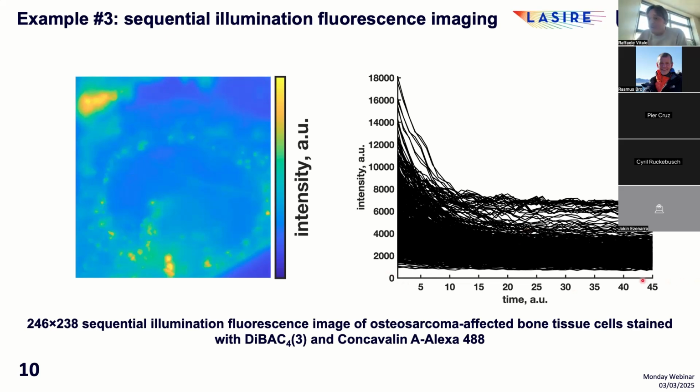Recovered over 45 consecutive time instants across a series of 6 photo-bleaching recovery cycles. During these cycles, the laser power was modulated differently in an attempt to emphasize the distinctive dynamic behavior of the various fluorescent species bound to the individual compartments of the system under study. Also here, these decays follow multi-exponential functions as the ones I showed you previously, that are the combination of mono-exponential contributions, each one related to a fluorophore located in a particular chemical environment.